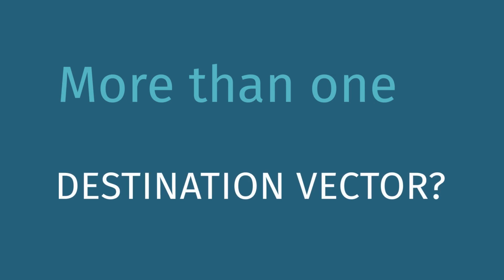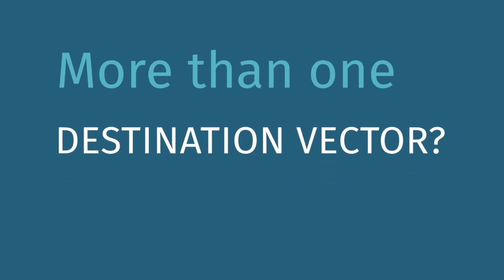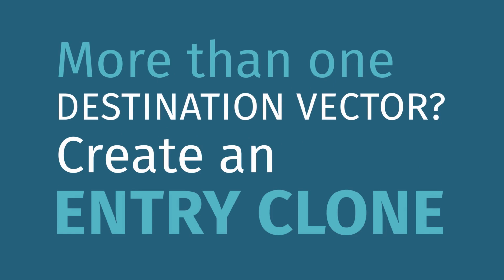However, if you plan on testing your gene in more than one destination vector, it might be better to create and sequence verify your entry clone. This will guarantee that related experiments are based on the same molecular clone.